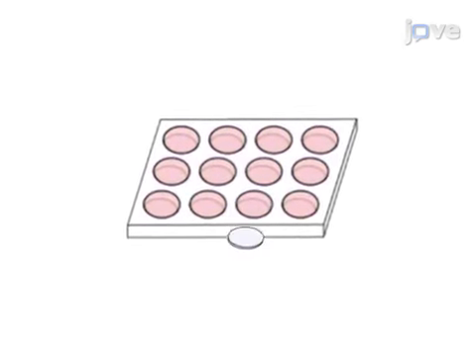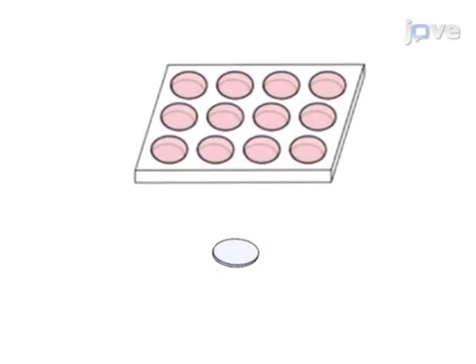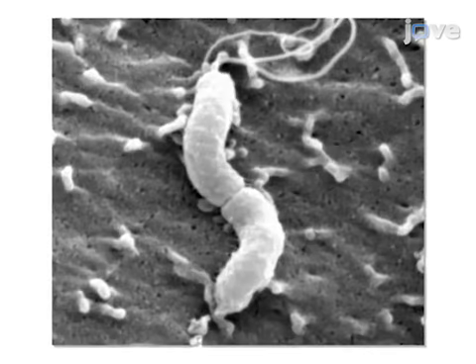Ultimately, high-resolution scanning electron microscopy is used to show increased CAG type 4 secretion system pili production under conditions of iron limitation. The technique in this manuscript is important to H.